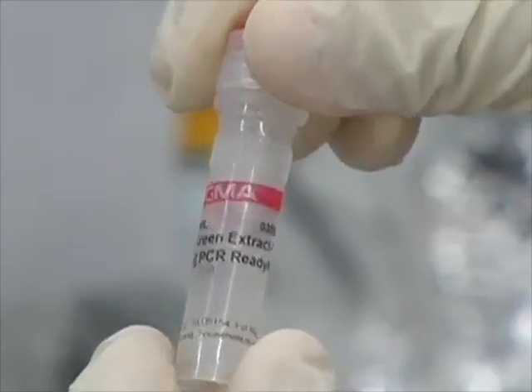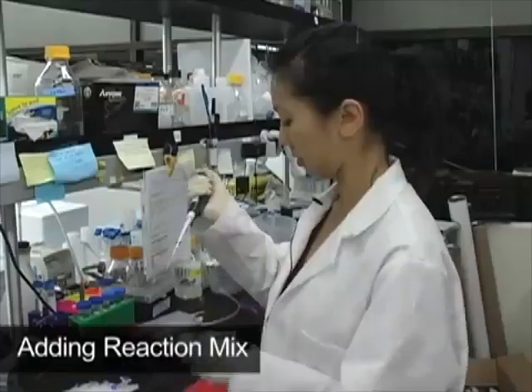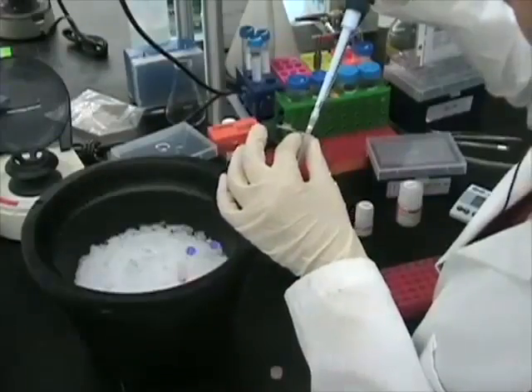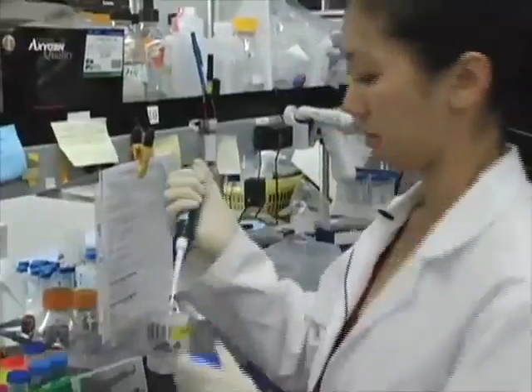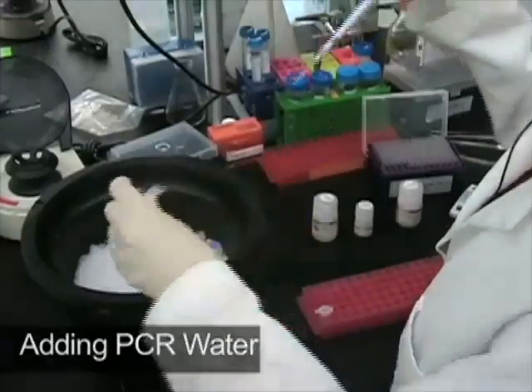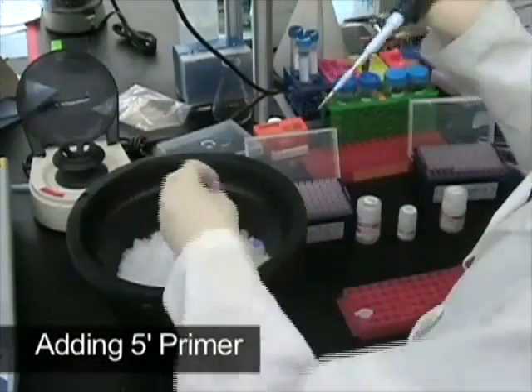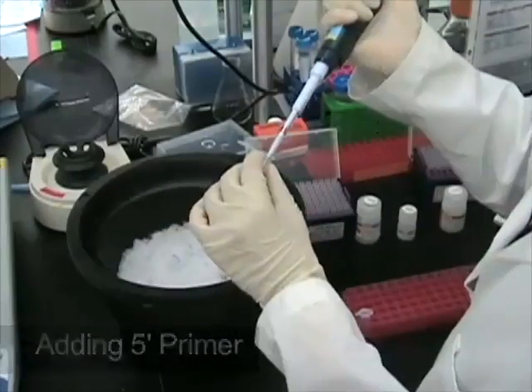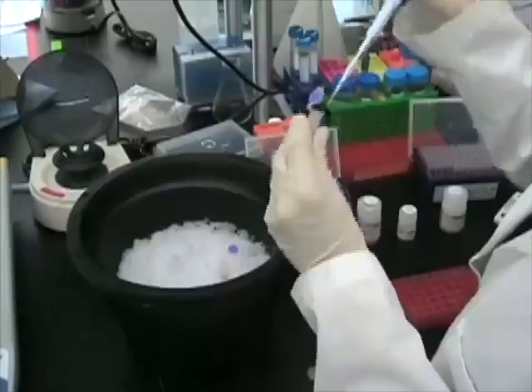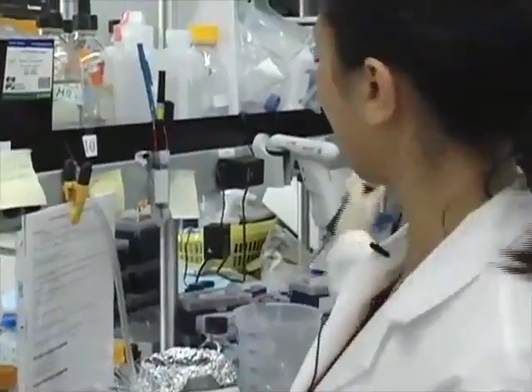During the 10-minute incubation, I'm going to prepare my SYBR Green master mix, which involves the SYBR Green master mix that they include in the kit, Milli-Q or PCR grade water, and our forward and reverse primers. And that's it.